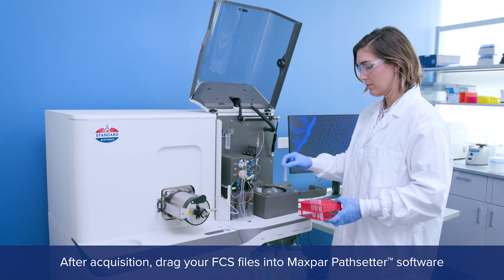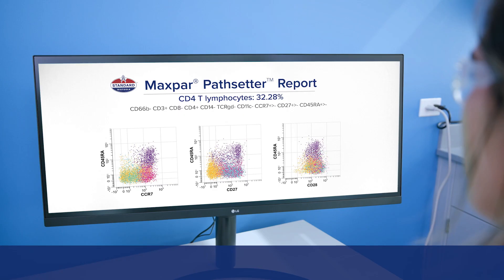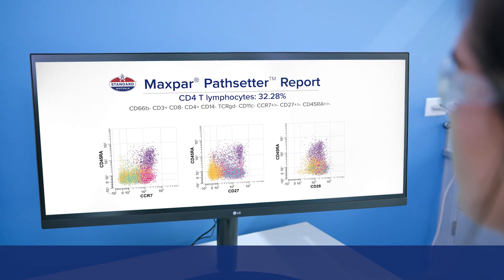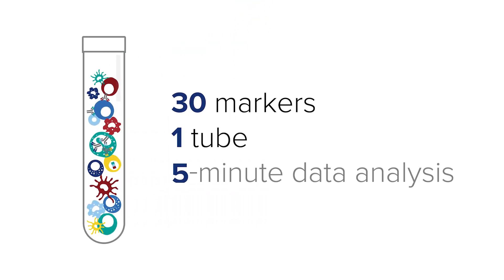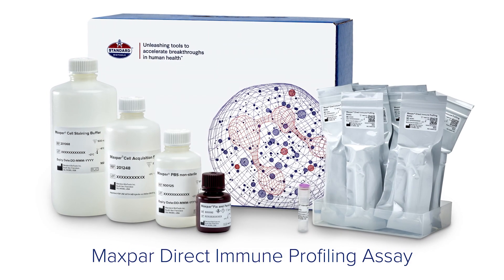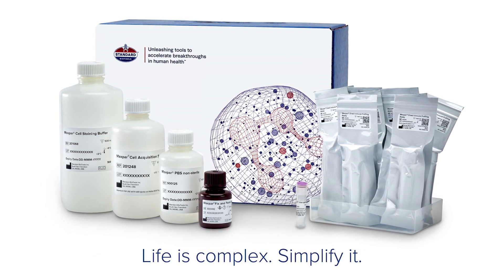After acquisition, drag your FCS files into Maxpar Pathsetter software to get actionable insights. It's that simple. The Maxpar Direct Immune Profiling Assay. Life is complex. Simplify it.